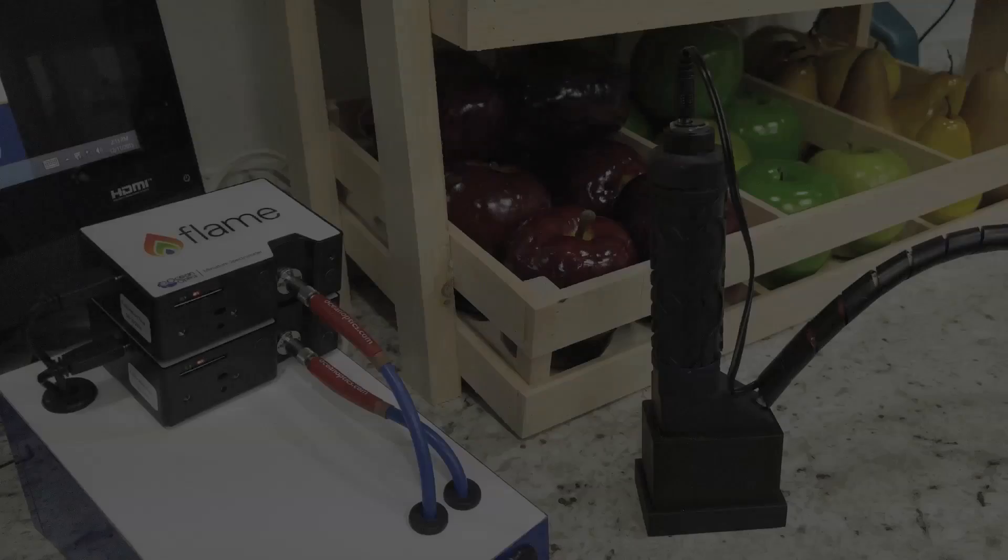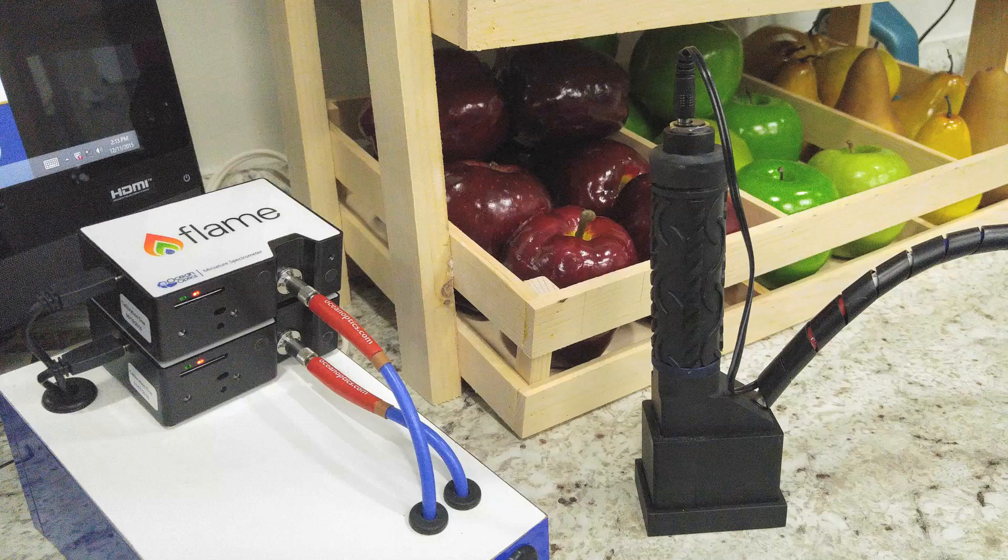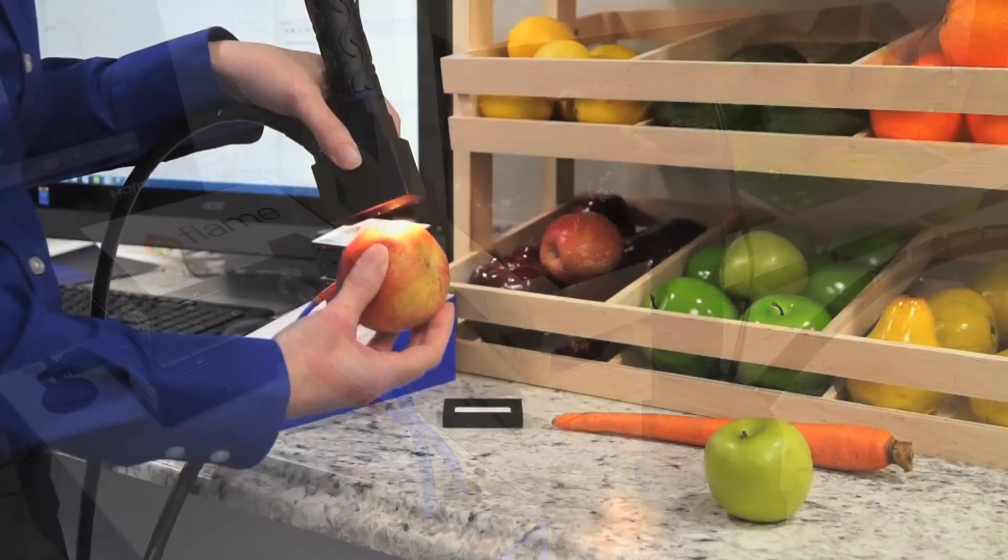Here, we've put together a reflection measurement system to look at moisture and other parameters relevant to ripeness.